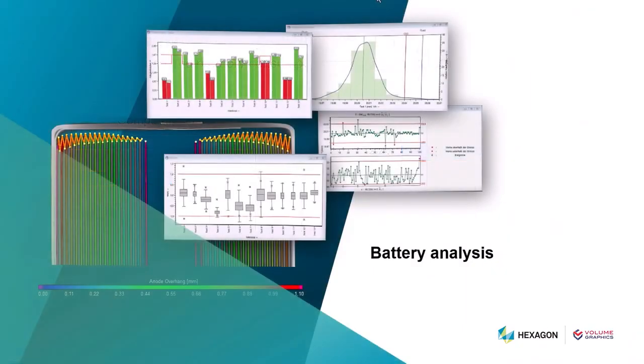Customers doing series inspection of batteries will be glad to hear they can now export the toleranced anode overhang results in QDAS format. Statistical process control? No problem.